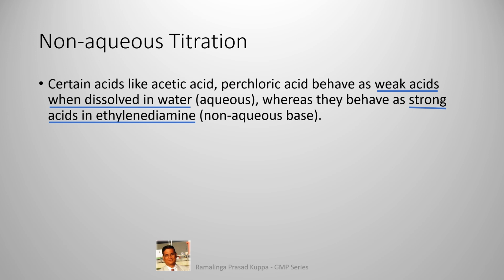This technique is very useful for assaying pharmaceutical compounds. Also, it provides a suitable solvent for dissolution of many organic compounds. Perchloric acid and acetic acid are the most used non-aqueous solvents. The endpoint determination also will be very precise.